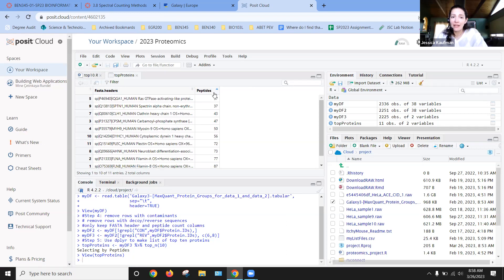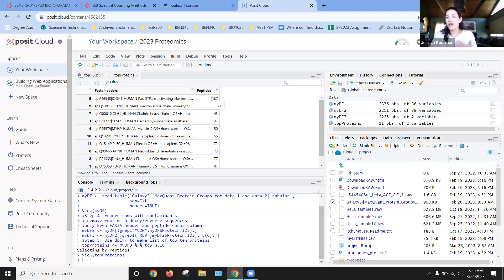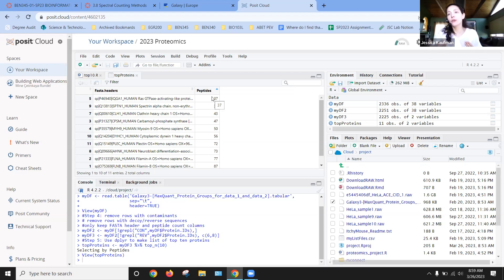And that's because when you use the Deplier tool to find the top 10, the proteins that you find can have a tie. So if we sort this by number, you can see there are two proteins. So number 10 and number 11 both have 37 peptides. And Deplier won't make a choice for you. It's going to include both in your list.